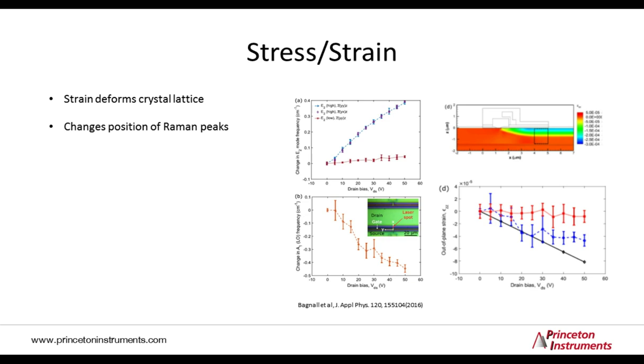Consider now a situation when stress is applied to a material, for example, by stretching or compressing it. This will lead to a stretch in the molecular bonds that will lead to changes in the energy of the lattice vibrations. And that change can be detected as a shift in the Raman bands. You can then use a calibrated measurement or modeling of your device or sample to reverse the problem to measure that quantity using Raman. So in this case, to measure strain using the Raman spectrum.